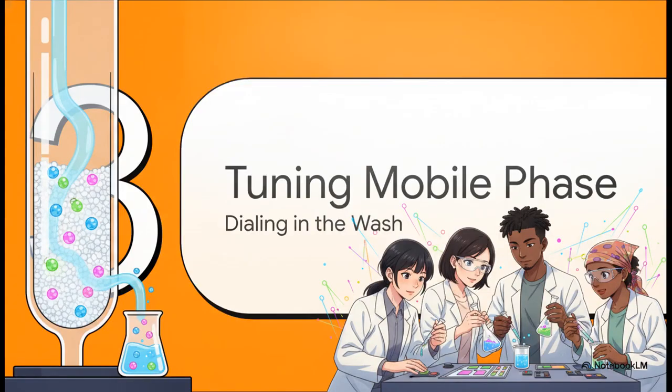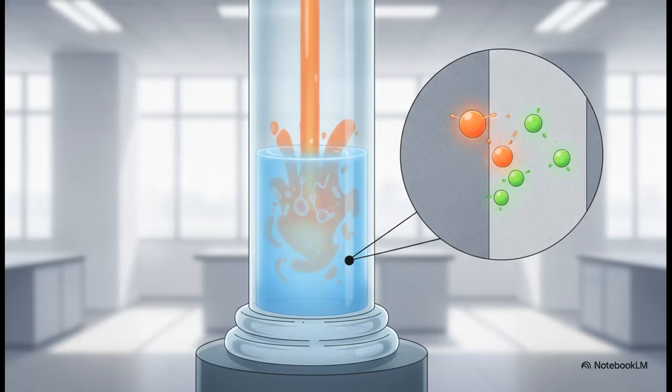All right, Section 3, tuning the mobile phase. Let's dial in the perfect wash. So our target molecules are stuck fast to the silica wall. How do we actually get them off? Well, the mobile phase isn't just some random liquid. It's a highly engineered mixture.